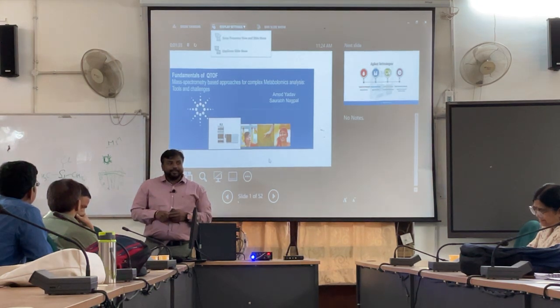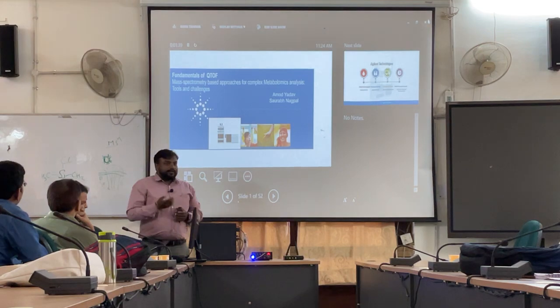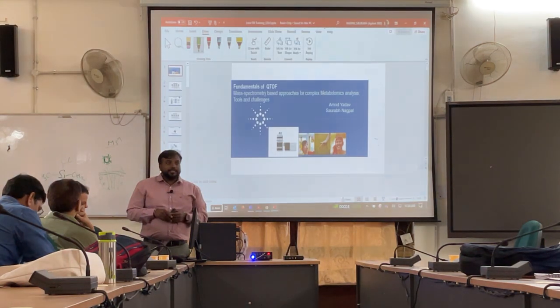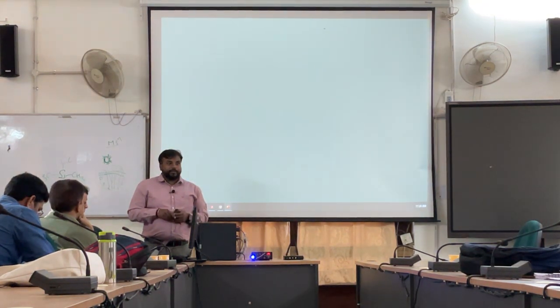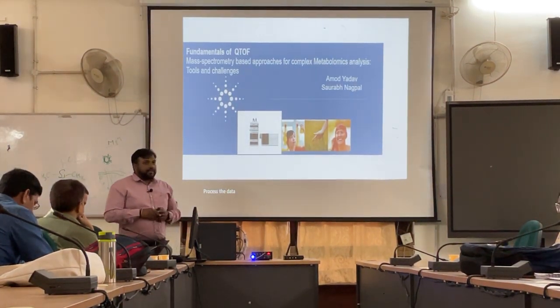So now we will go with some technological part of QTOF. Apart from this, instrumentation and their principle, Saurabh sir will take care of the metabolomics and their importance and how we can process the data with the available software with QTOF.